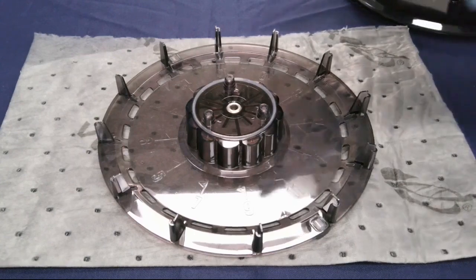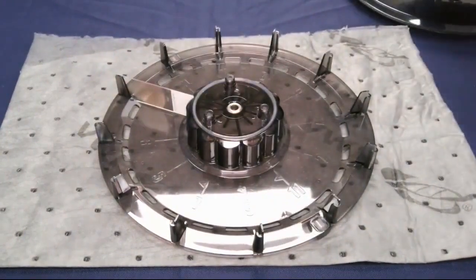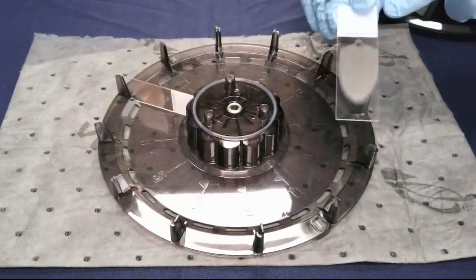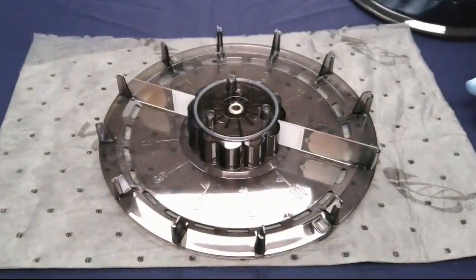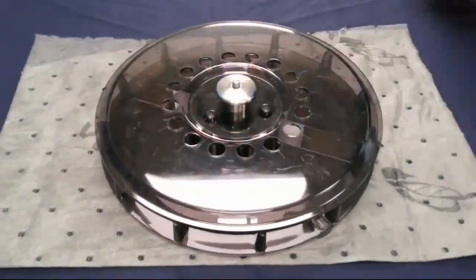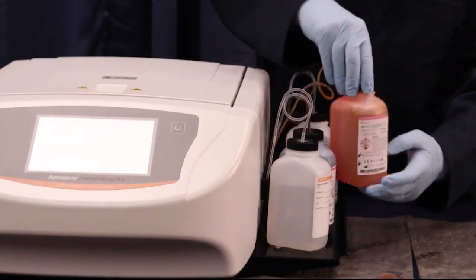We are now going to demonstrate how the ELITech Aerospray Pro instrument works for blood smears. It is critical that the slides are loaded in the carousel correctly, facing clockwise with the frosted edge to the hub and on top of the corresponding number of the slide. Then reattach the top of the carousel. For reagents, the Aerospray Pro uses a buffer, thiazine dye, eosin, and methanol for fixation.